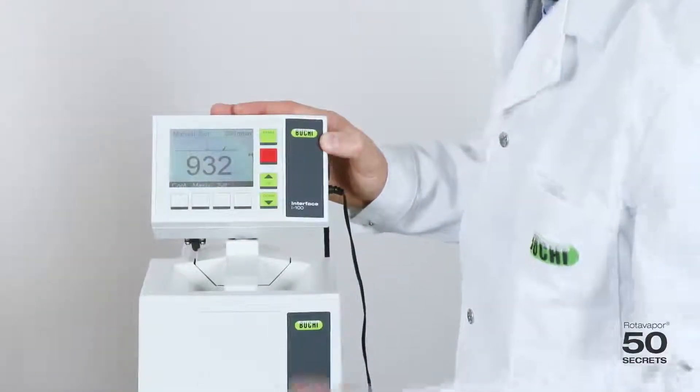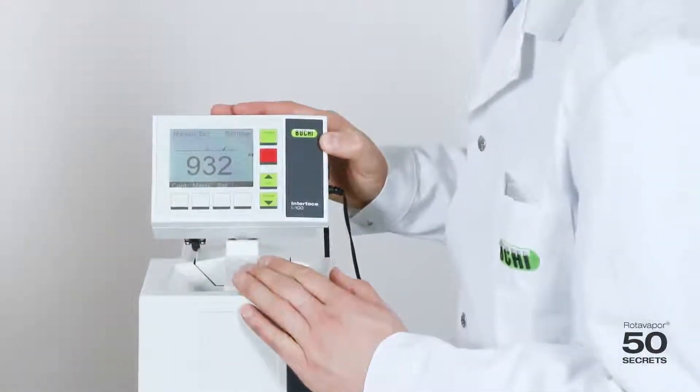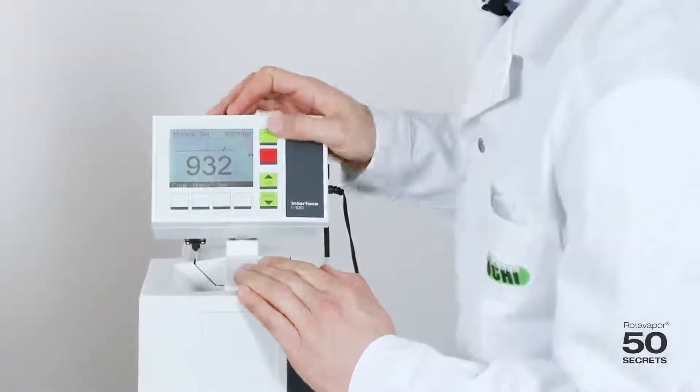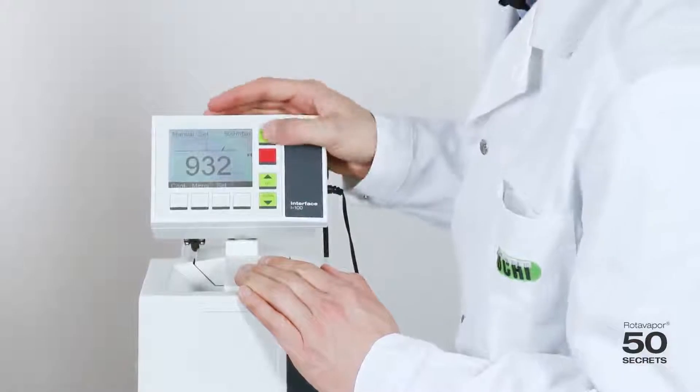First, I would like to talk about the V100 vacuum pump, which has on-off. I would like to show you how that works. I set it to 500 millibar, I press start.